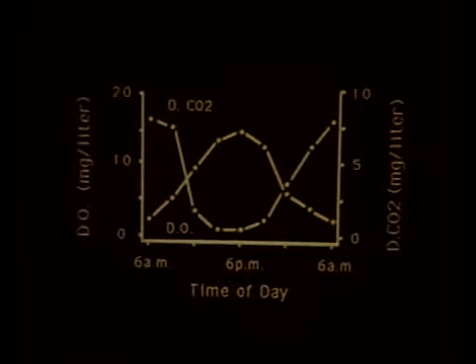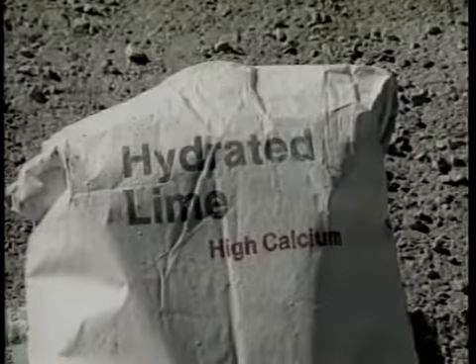It is wise to initially test your water source for carbon dioxide levels. Carbon dioxide can be reduced by application of hydrated lime. However, care should be taken not to raise pH too high, causing fish kills. Testing procedures and corrective measures regarding carbon dioxide will be discussed in videotape 3 of this series.